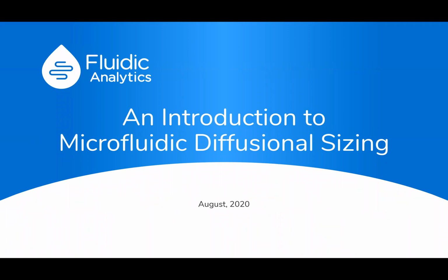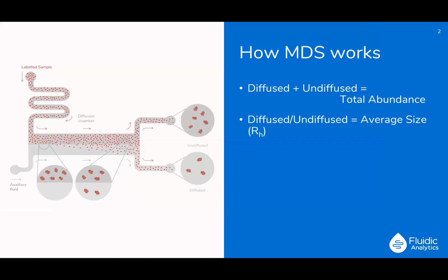And today I'd like to give an introduction to a novel method for measuring protein interactions in solution called microfluidic diffusional sizing. So how does microfluidic diffusional sizing work?